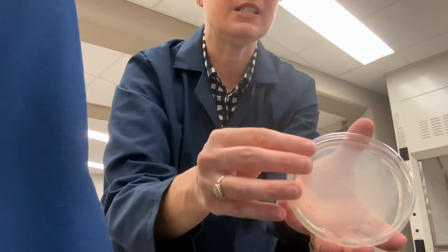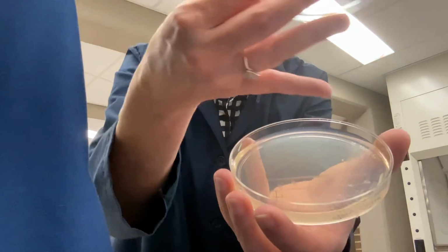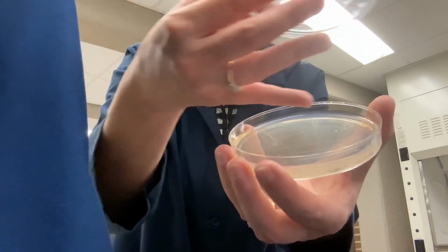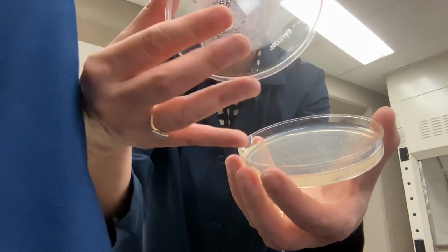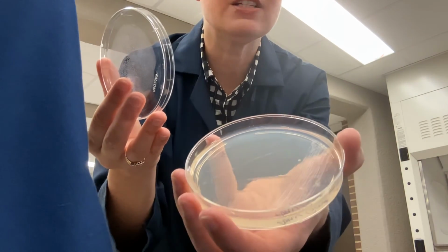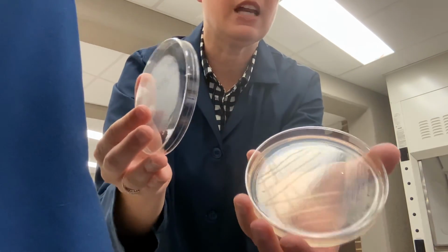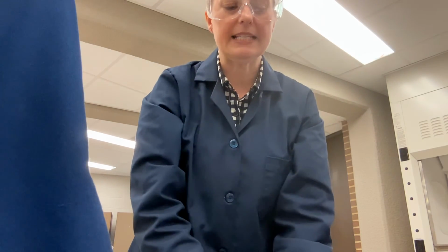Again, you're never going to open plates like this, ever, ever. But I just want you to be able to see kind of what these streaks look like. If I hold the light just right, you can see here was zone 1 with a lot of streaking back and forth from edge to edge. Then we pulled into zone 2, and again, edge to edge, pulled to 3, and then pulled to 4. As you do that, you have these lines, but there's not huge gouges in the agar. Again, you're never going to take the lid off this far, but just so that you can see kind of what I did. Last but not least, kind of like a cooking show, I'm going to go get a plate out of the incubator so you can see the result.